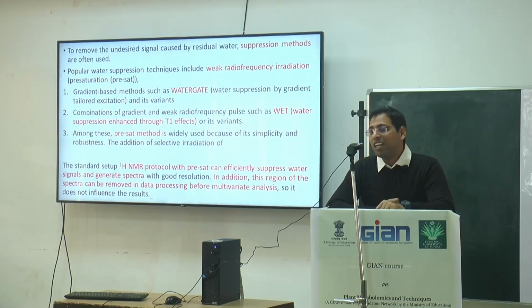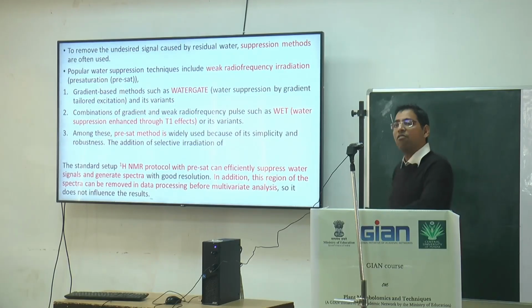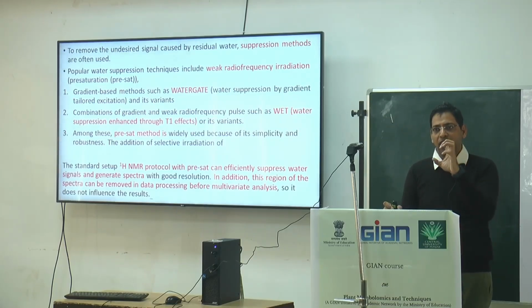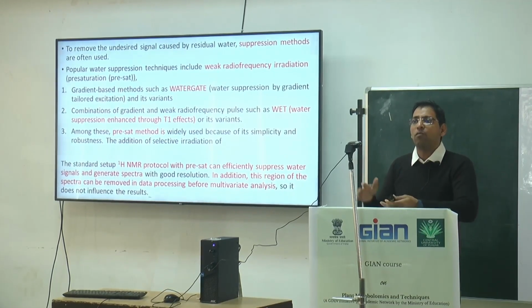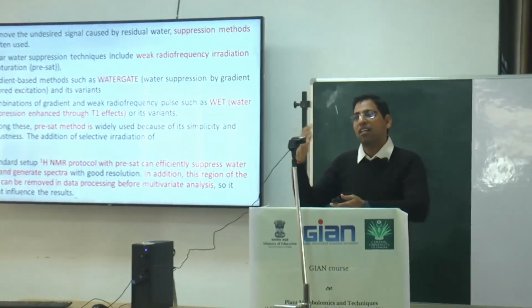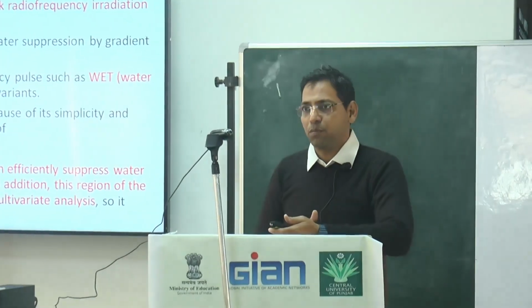So we have to reduce the signal caused by those water molecules by using suppression methods. With suppression, we can make those peaks zero, so that in the new pattern we cannot find the signal caused by the water molecule. That is easy for us for analysis purposes.